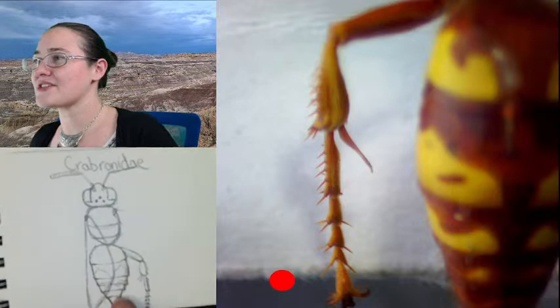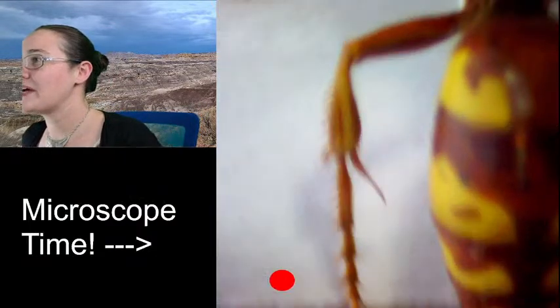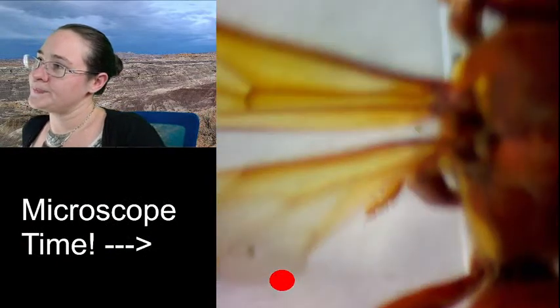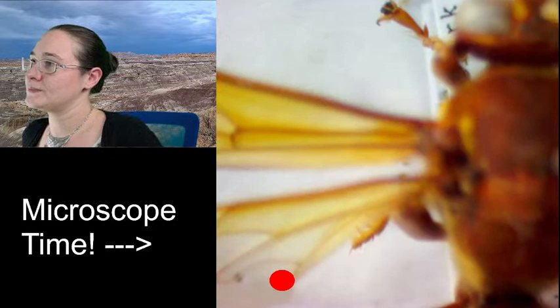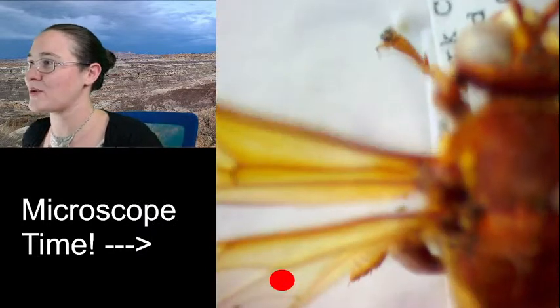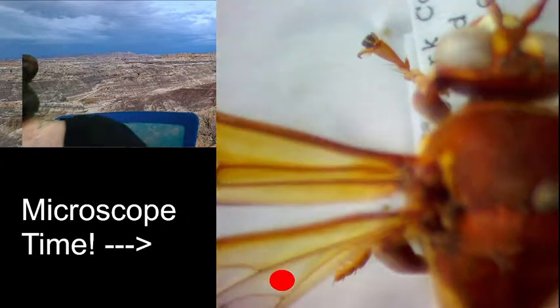Cool. All right, so we've got that hind leg taken care of. I think we can move the specimen up. And it looks like we'll be able to see both the middle and the front legs in one shot, although it's going to be a little difficult.